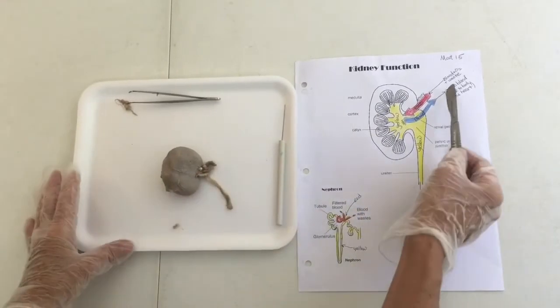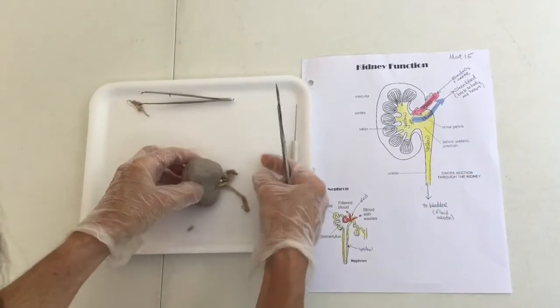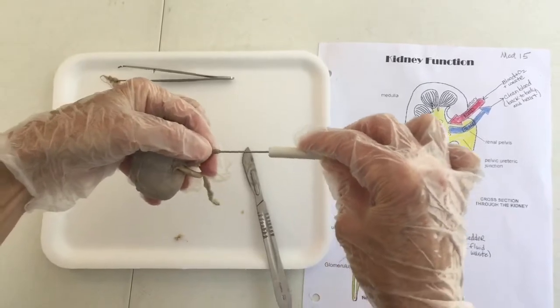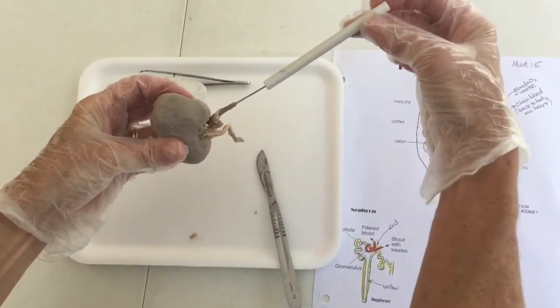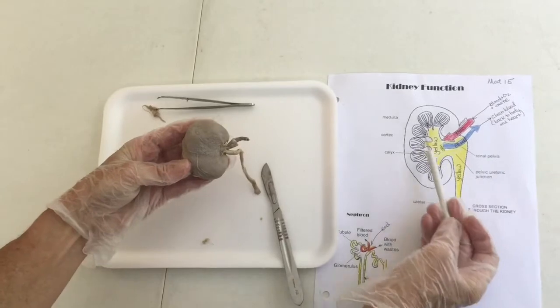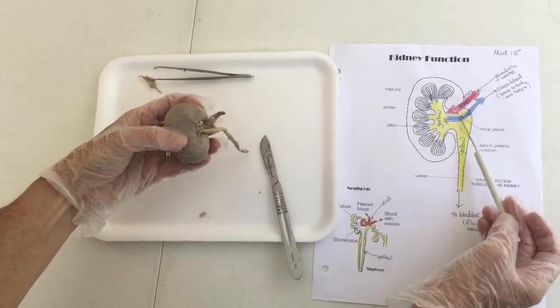The oxygenated blood comes in through the renal artery, which I showed you earlier. If you had a poker, you can stick it right in there. You can see it is an actual artery, a vessel where the blood would circulate in. Then it's going to go through here. We're going to look inside in a minute and do all its magic on the inside. And then it's going to come back out.